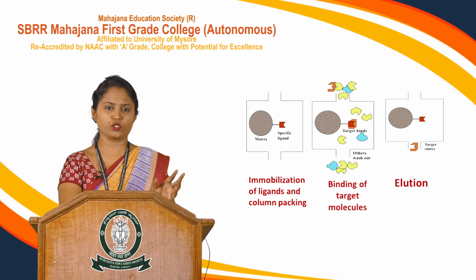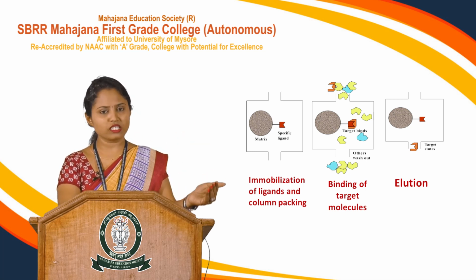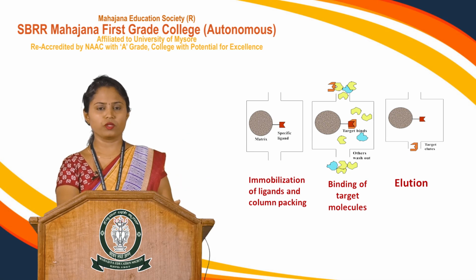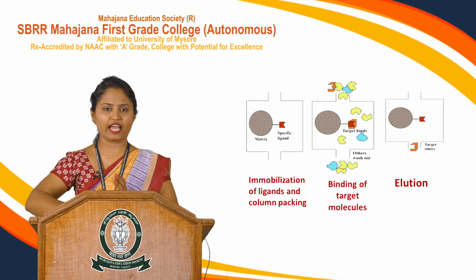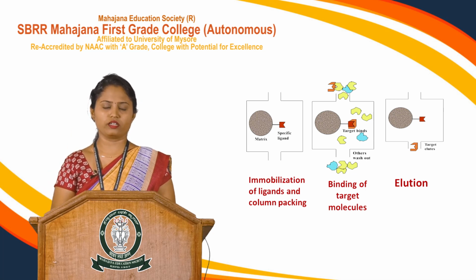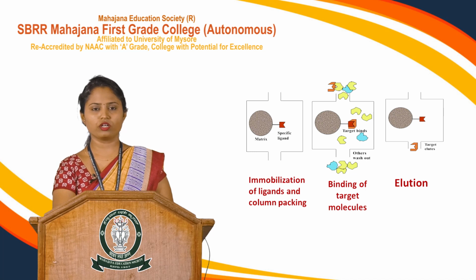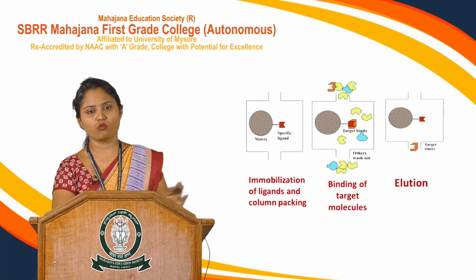After a certain incubation time, you wash out the unbound ligands. Then you can reload the sample to the column. Once the sample is loaded, the binding affinity exists between the ligands and the target or interested molecule to be isolated. Once the binding of the molecule has been done, the other molecules which lack the affinity are eluted out. You can see the other molecules which have been washed out.